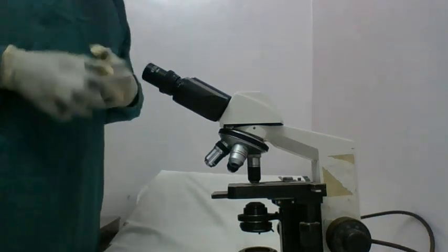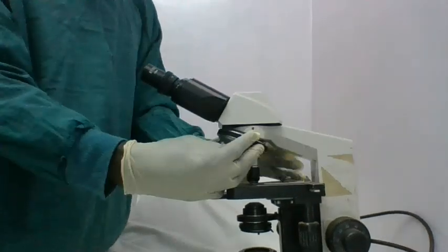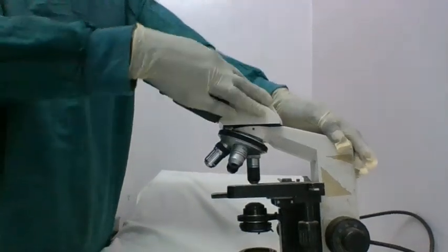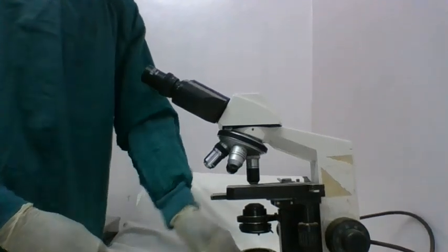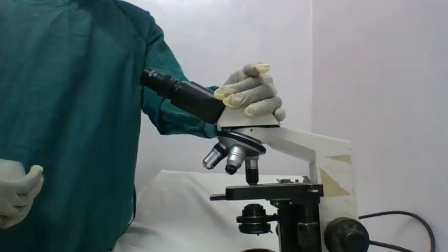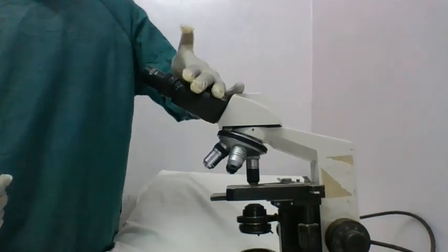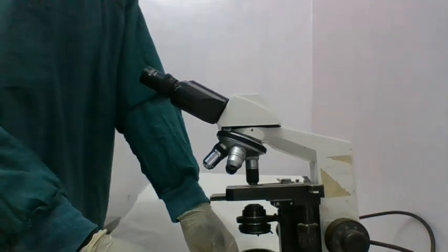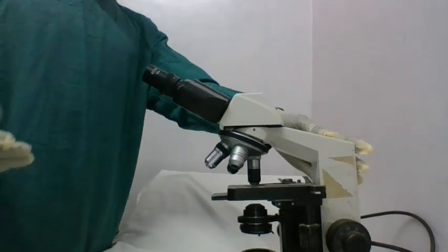So, in today's episode, we are going to look at a very important tool in medicine that helps us come up with a proper diagnosis of a patient. And what tool are we talking about? It is the microscope, guys. This is the microscope, a very important tool in making proper investigations. It is basically used in the laboratory, as most of you know. It's found in the laboratory section of the hospital unit.